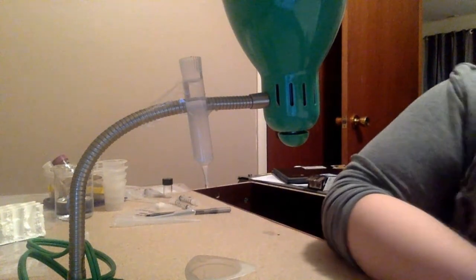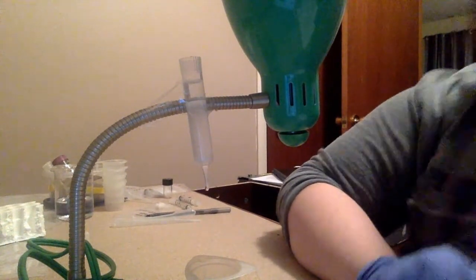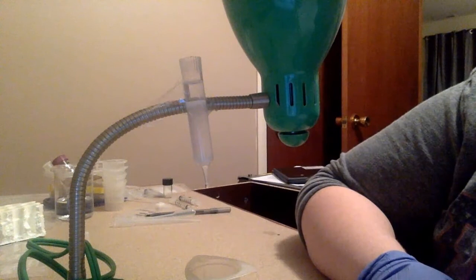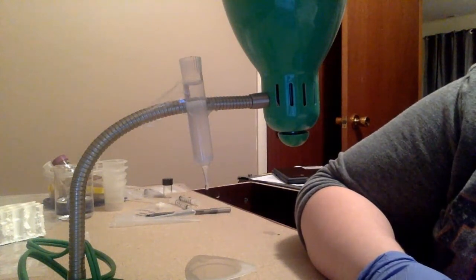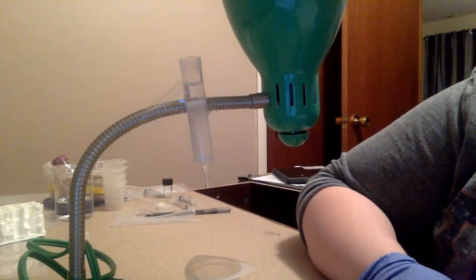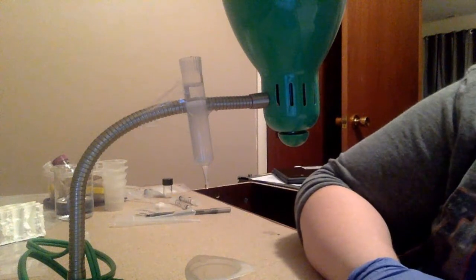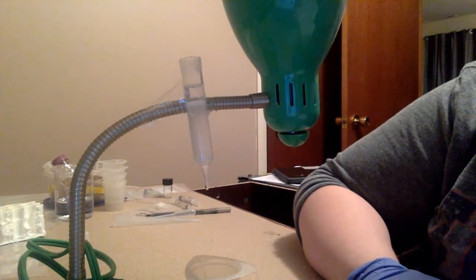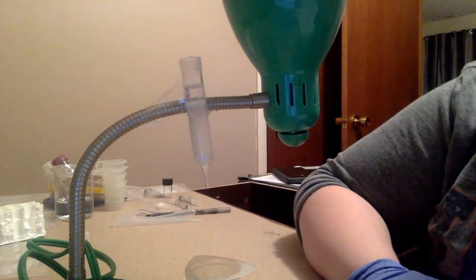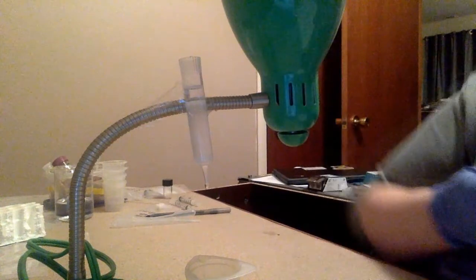So first, we're letting our liquid flow all the way through until it stops dripping. What this is going to do is cleanse out the column to make sure that we're not going to have any contamination when we actually put our sample inside.